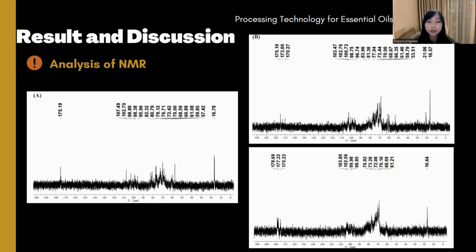In addition, chemical shifts are used to determine the derivatization state, but this only applies to structurally simple polysaccharides. Even so, it is still possible to get some useful information from it. The signals of the chemically modified polysaccharides around 60 were significantly displaced. As inferred above, this region was mainly attributed to the C6 signals of monosaccharide residues, which implied that C6 is an important chemical modification site.